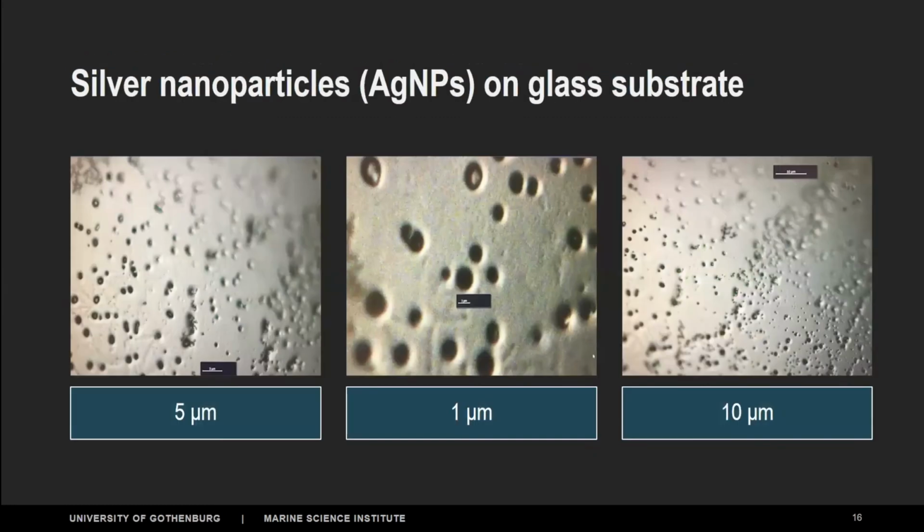Yeah, I have some pictures of the silver nanoparticles, and we see they are quite big, different sizes, round in shape. And the idea to get higher and higher enhancement is you need a kind of matrix of these nanoparticles. So if you have junctions, and if they are really rough, people are trying to design them, so they are pyramids, stars, cylindrical forms. You can create them in a chemical form, you can do lithographic printing. So there's a lot going on when it comes to nanoparticles.